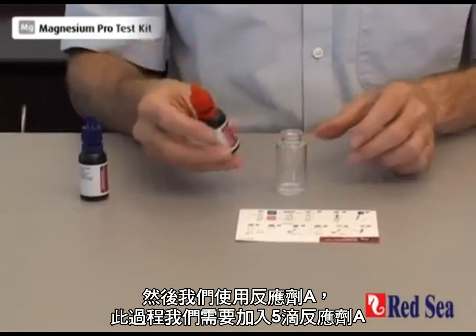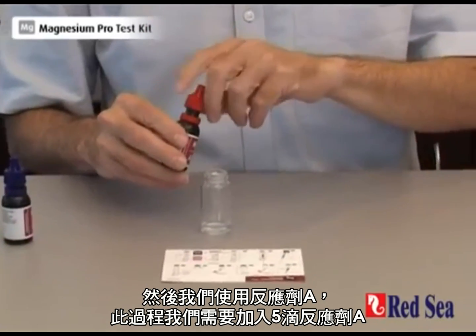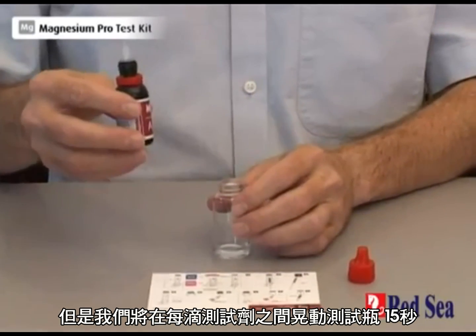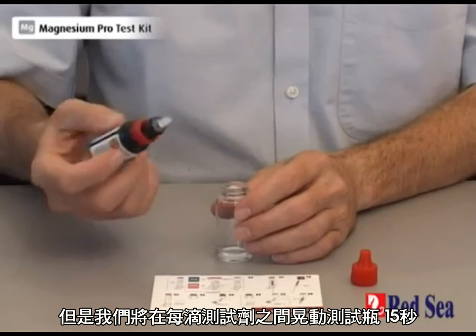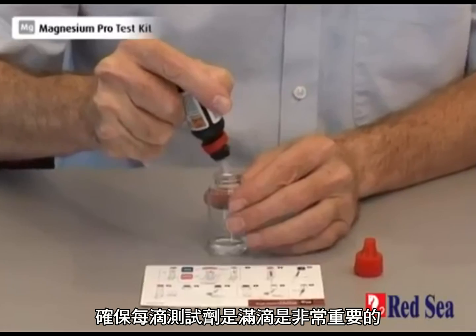We then take reagent A of the test and we're going to put in five drops, but we're going to put them in one at a time and we're going to shake for approximately 15 seconds between each drop. It's important to make sure that each drop is a full drop.